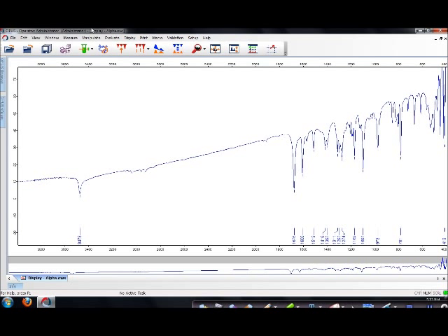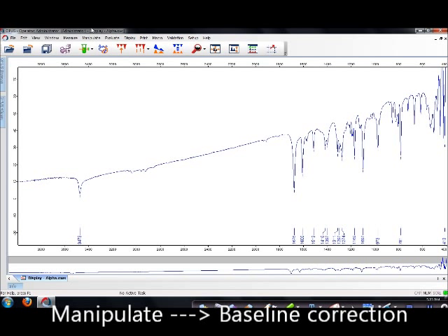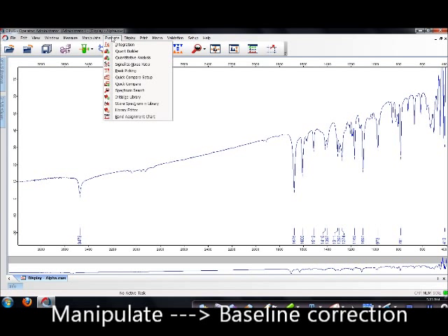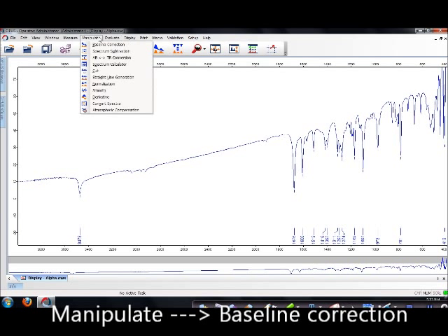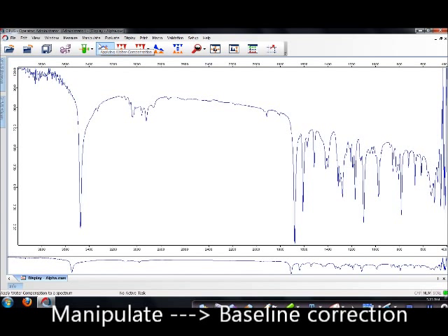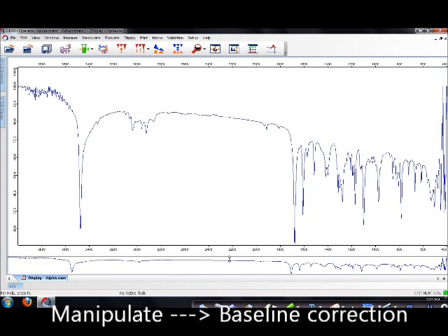If you wish to perform baseline correction, at the same spectrum, you can go to the top rows of tabs, click on Manipulate, and then Baseline Correction. And you'll see that your new IR spectrum looks a bit different from the one previously.